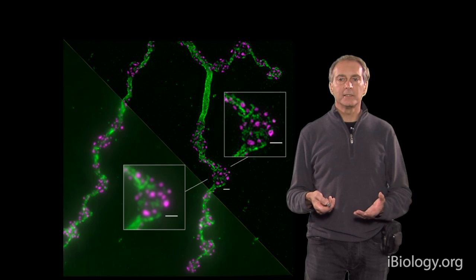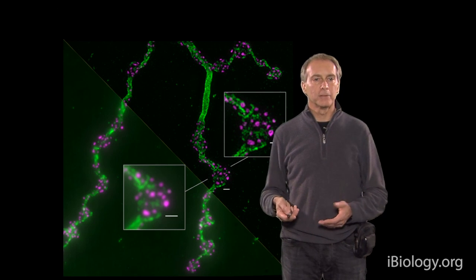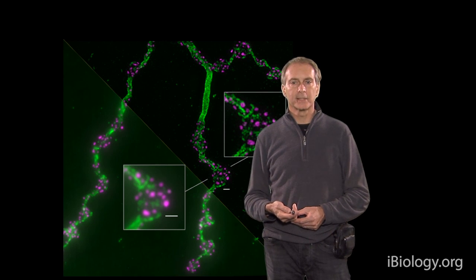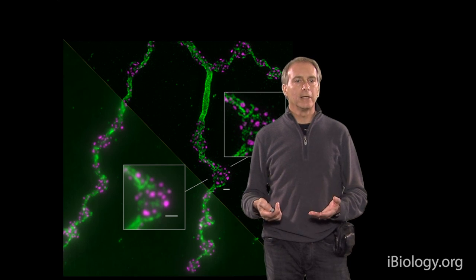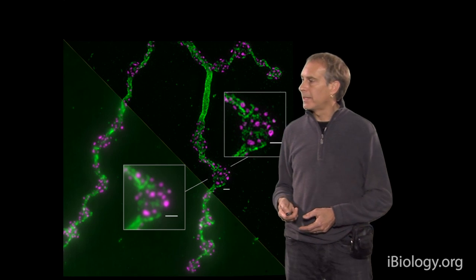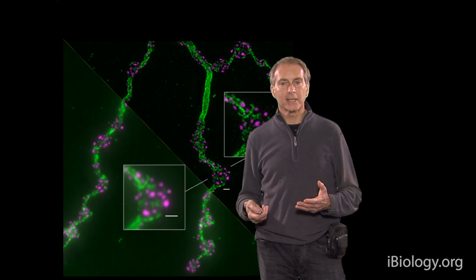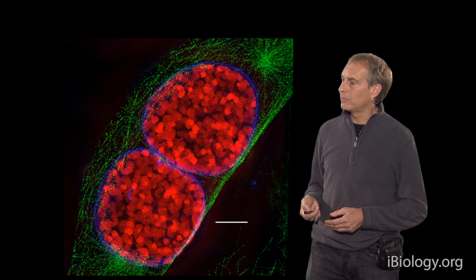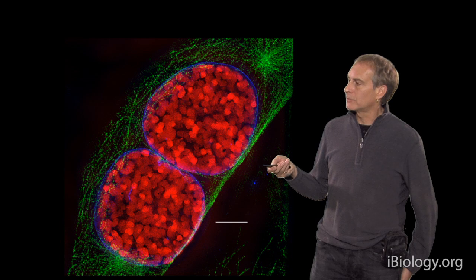And this methodology lends itself very nicely to live imaging as well, and it's only limited by how fast we can form those patterns. And recent work, both at Janelia Farm and here at UCSF, has used solid state devices to generate the patterns, essentially like in a video projector, instead of having to have a physical grating that you rotate and translate. And that allows us to do a complete 3-dimensional stack within a second on live samples. So it's quite exciting.